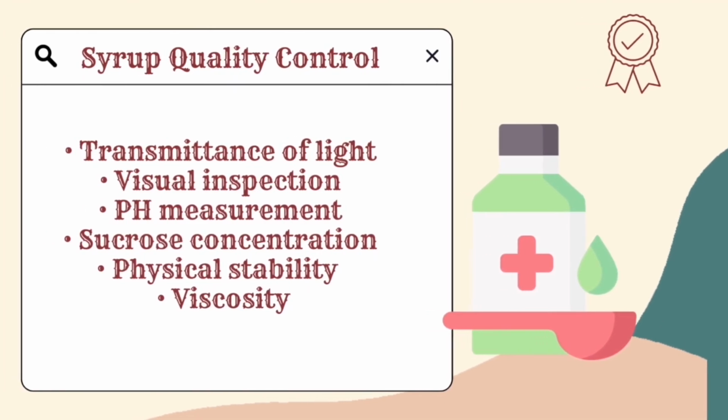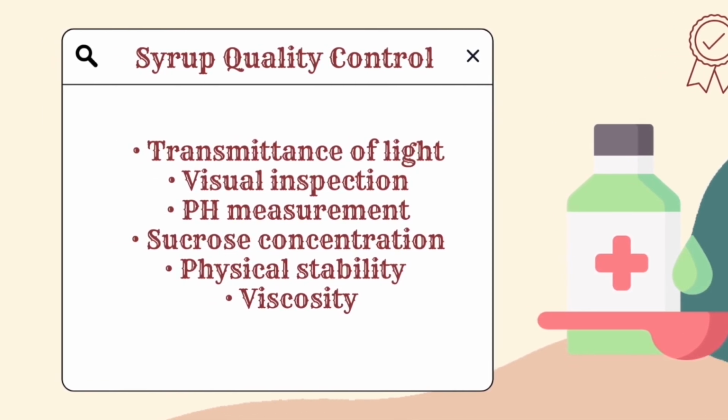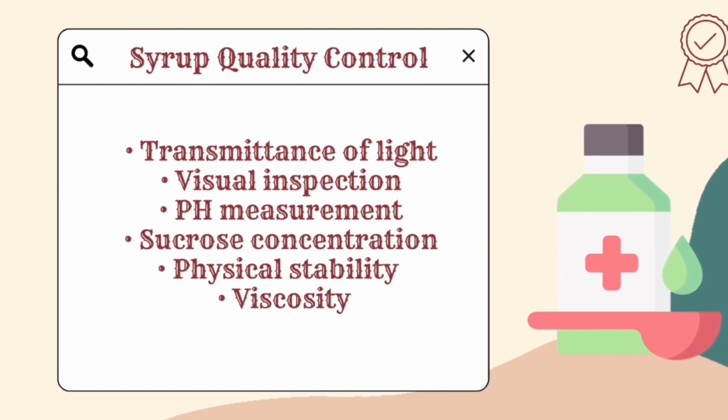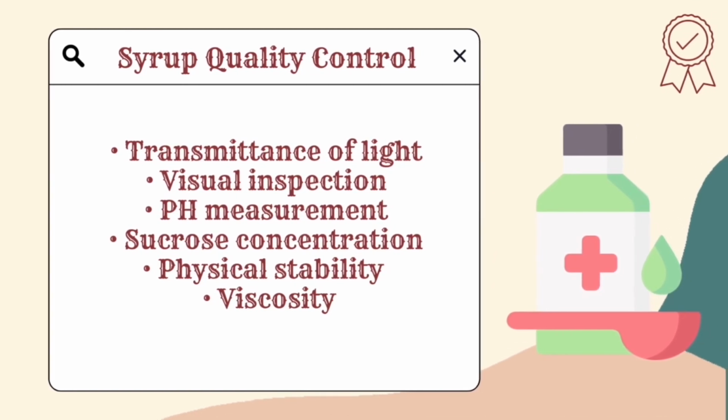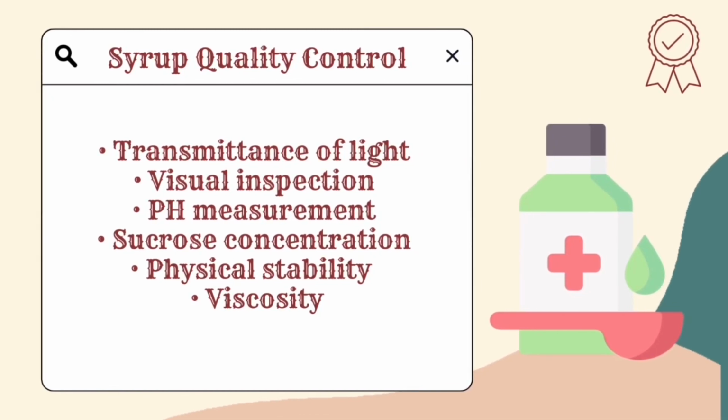Quality control tests for syrup: transmittance of light, visual inspection, pH measurement, sucrose concentration, physical stability of the syrup, and viscosity.